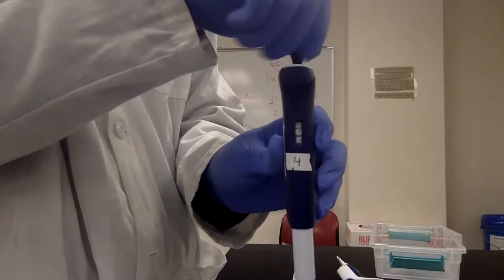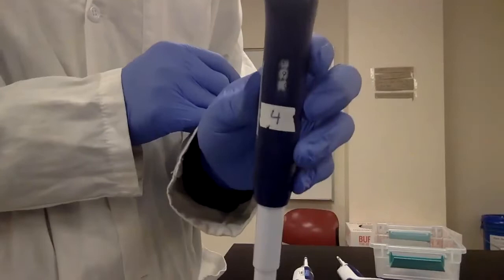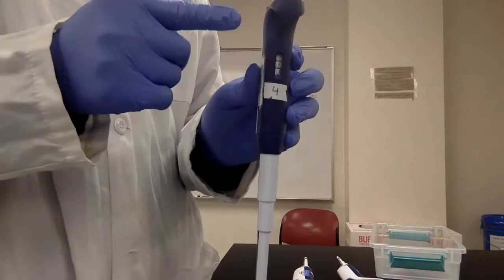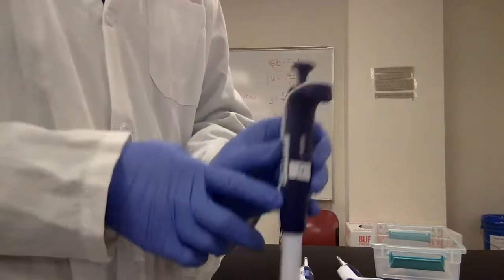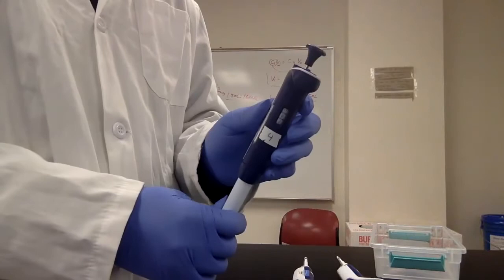For all the pipettes, you will read the volume from the top to the bottom. So for example, right now on this L1000 pipette, from the top to the bottom, it shows 090, which means the volume right now is 900 microliters. If I change it to 082, the volume it will handle right now is 820 microliters. That's how you read the L1000.